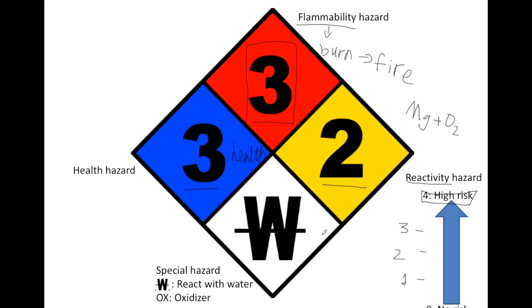And the white is the special hazard. So this little thing means it'll react with water. A huge O here. Sometimes you'll see flames on top of the O, sometimes not. But an O means oxidizer.